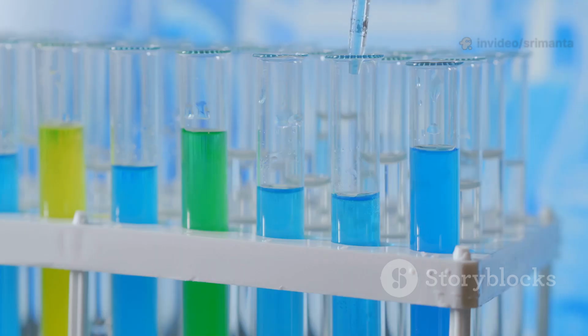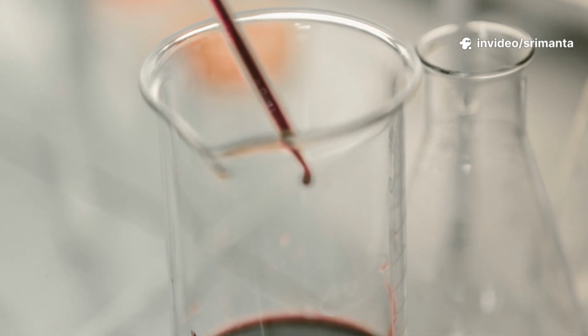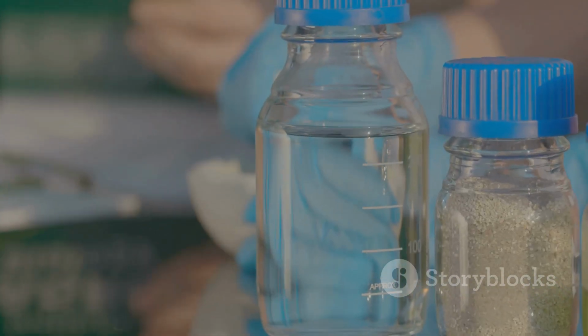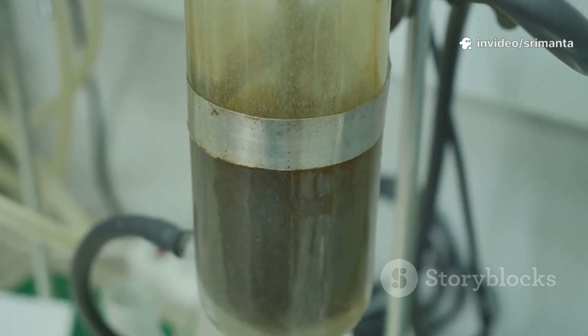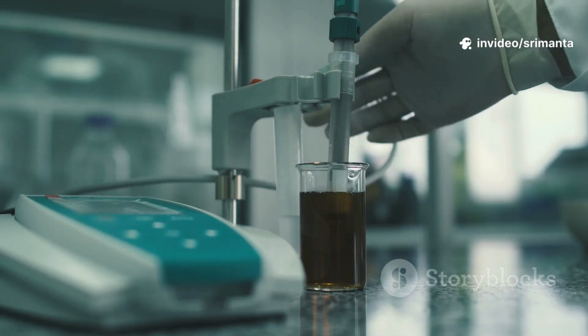We add stannous chloride, which helps the reaction along. We add potassium iodide, which ensures all the arsenic is in the right state to be converted. We also add a little bit of zinc. This carefully prepared mixture is now our test setup, ready to reveal if it contains any hidden arsenic. Each ingredient is added in a precise order and amount.